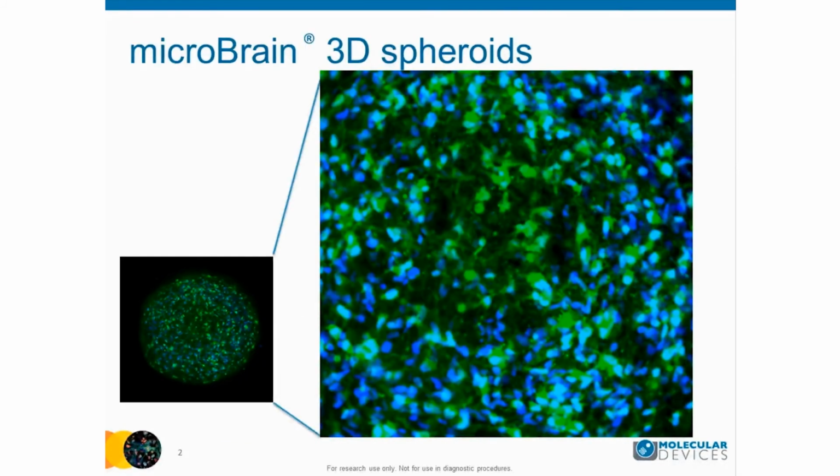There is an increasing need to use complex, biologically relevant, more predictive cell-based assays to screen and evaluate compounds with potential for neurotoxicity. The current methods for neurotoxic evaluation rely mostly on animal models, which have limitations related to throughput, cost, and relevance to human data.